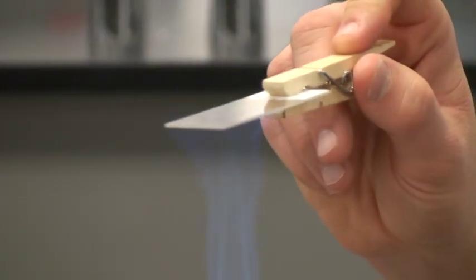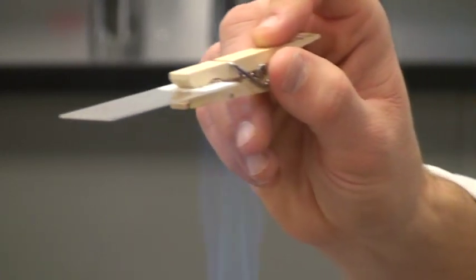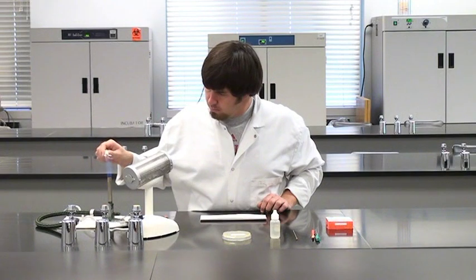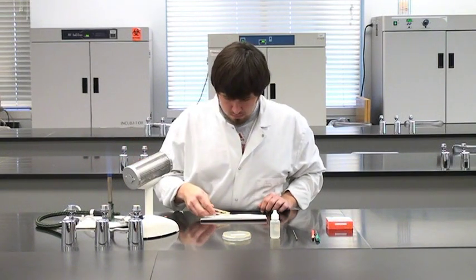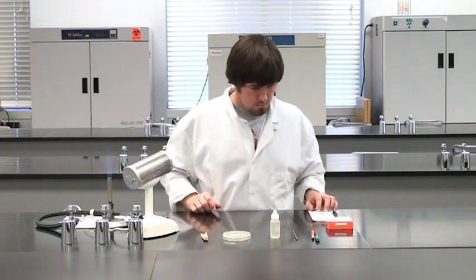The slide will break if it stays in the flame too long. It also may break if the sample is not completely dry before you heat it. The smear is now heat fixed and ready to be stained for examination under a microscope.